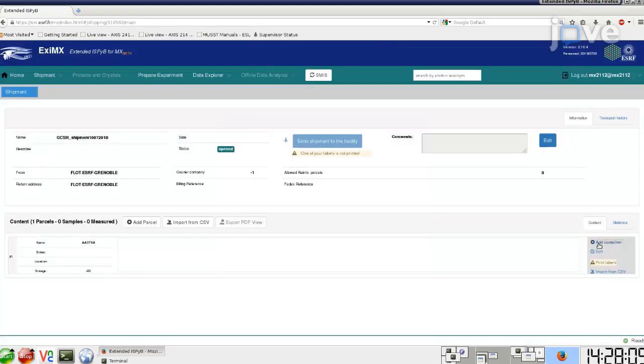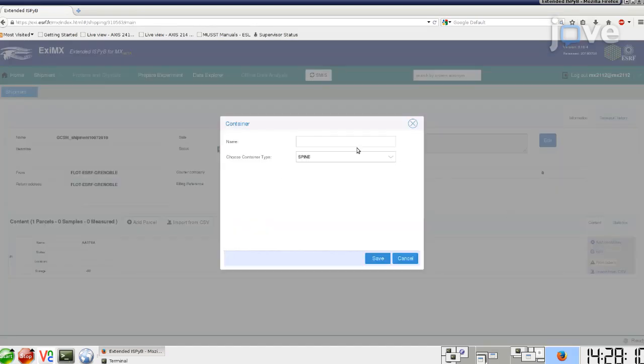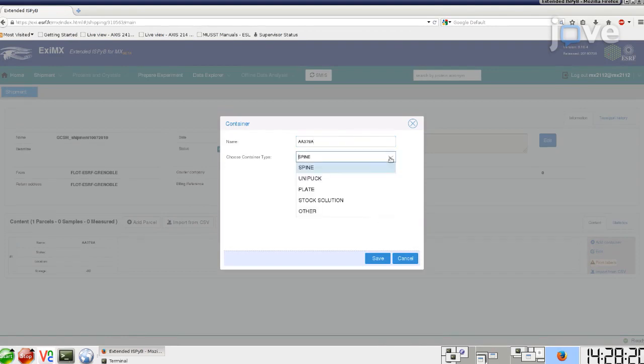Then click Add Container, give the puck barcode as the name, and choose SpinePuck. Again click Save.